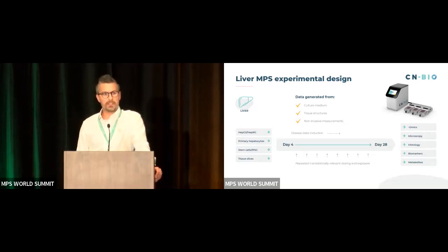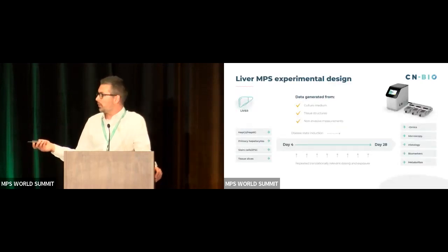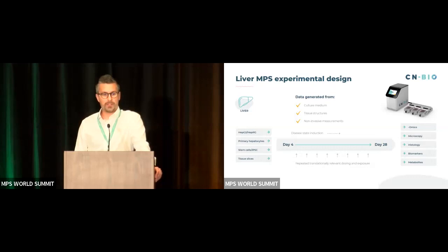normally takes a couple of days to seed those cells in, and we then have a really pretty long window to run experiments in. So this allows us a lot of opportunity to do a wide variety of different studies, either in the tox or efficacy space, to really evaluate how liver biology is changing following an insult.